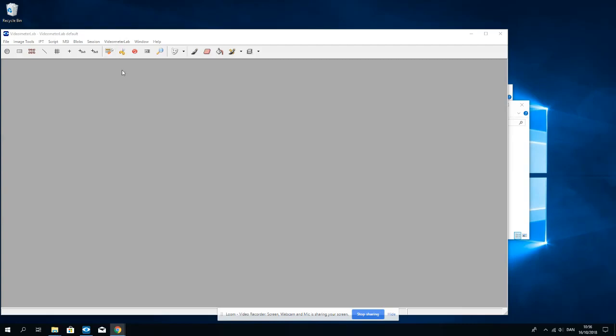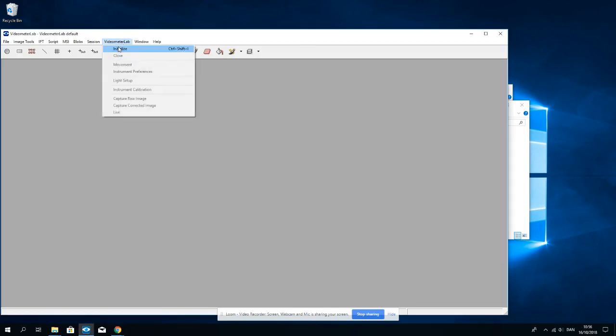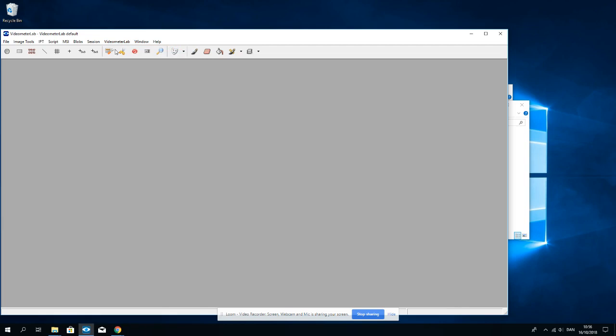I will now show how to capture time sequences of spectral images from the Videometer Lab. So first let's initialize the instrument. It will load the calibration, set up the instrument, and get back to me when it's ready.